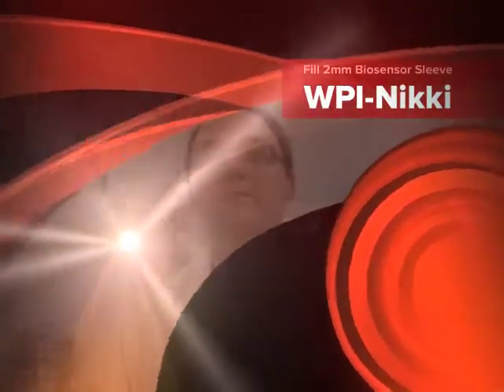Hello. Welcome to World Precision Instruments. My name is Nicky and today I will be showing you how we assemble and calibrate some of our sensors.